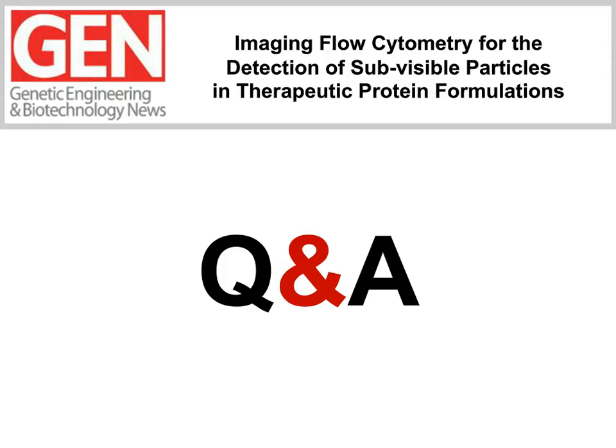That's a really good question. So obviously validated reference standards for protein aggregates don't exist. But my feeling is that you can, first of all, detect particles at least 1 micron and up. But the classification is interesting because what happens, as I showed you earlier in the presentation, is that protein adsorbs to the silicone oil droplet, which basically gives that silicone oil droplet a little bit of proteostat fluorescence intensity when it's been labeled. And then for smaller particles, basically because they have a high surface-to-volume ratio, this layer of proteostat on the surface can cause overlap between the fluorescence intensities of the smaller particles.